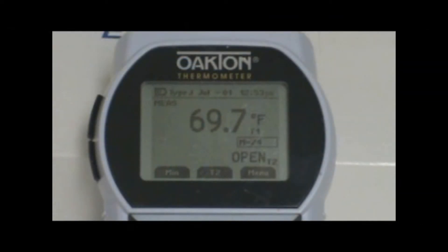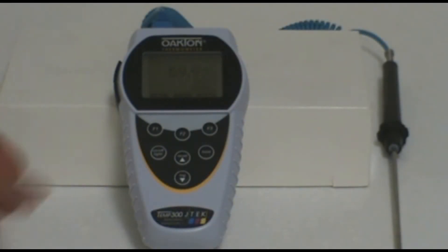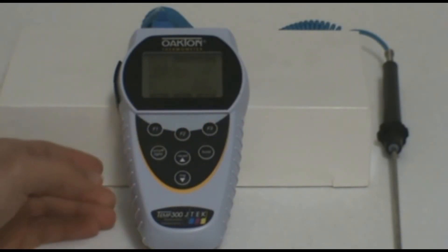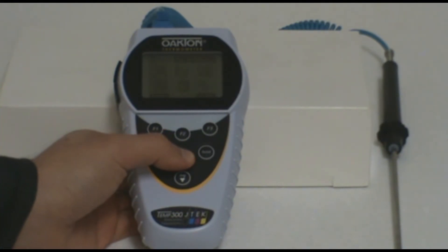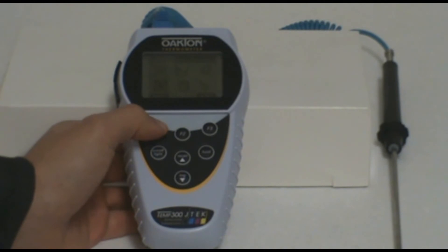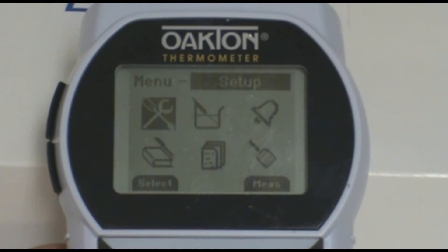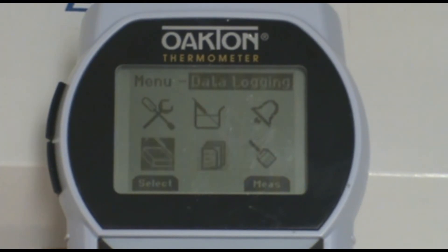The first thing you will want to do, once you have the probe plugged in and the meter turned on, is set up the data logging function on the meter. To do this, press the menu or F3 button, then use the arrow keys to scroll to the icon that resembles a book and pen. This is the data logging icon. Press the select or F1 button to enter the data logging setup.